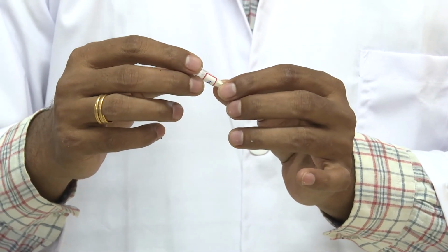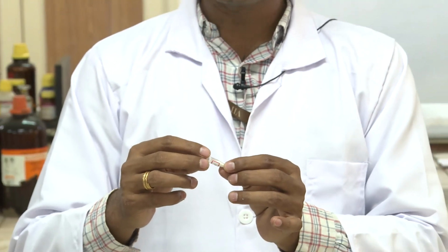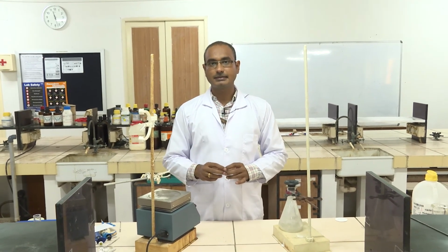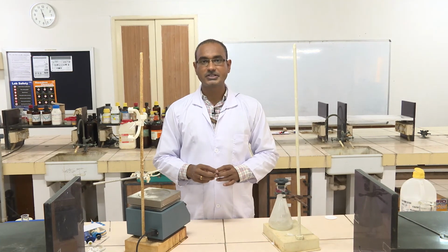I transferred the material from the silica crucible to this Eppendorf tube. Now I am going to submit it for powder XRD. Now this powder XRD was analyzed, and after that the crystallite size was determined using Scherrer's equation.